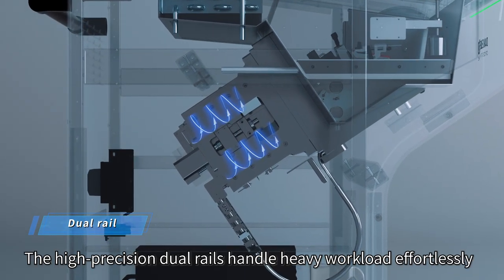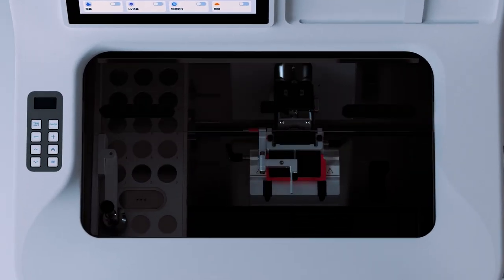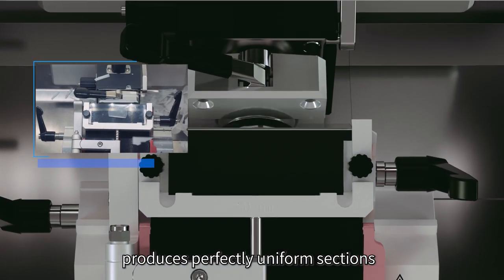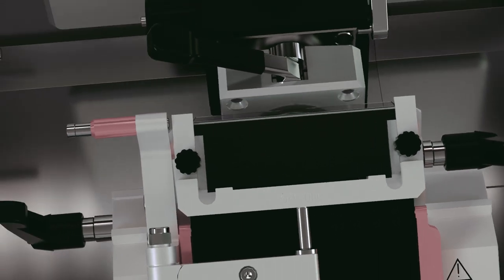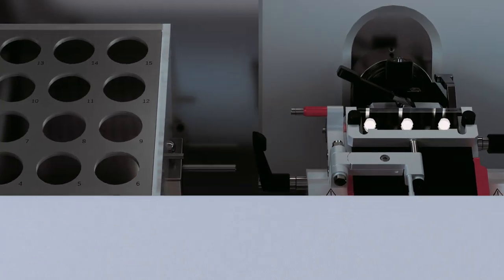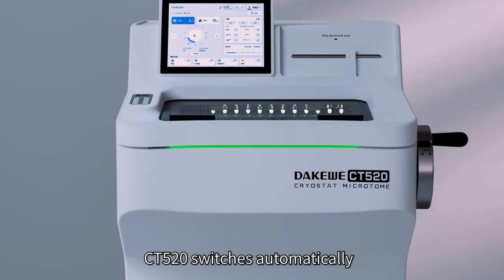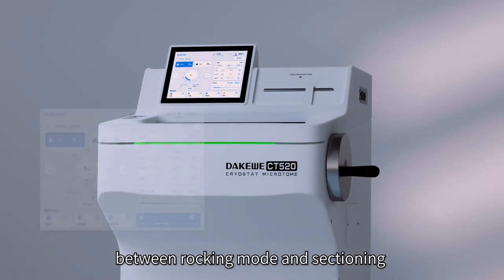The high-precision dual rails handle heavy workload effortlessly. Explicit specimen fitting produces perfectly uniform sections. A steady blade holder guarantees consistent sectioning. The CT520 switches automatically between rocking mode and sectioning.